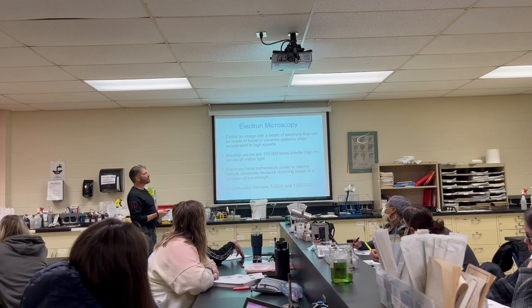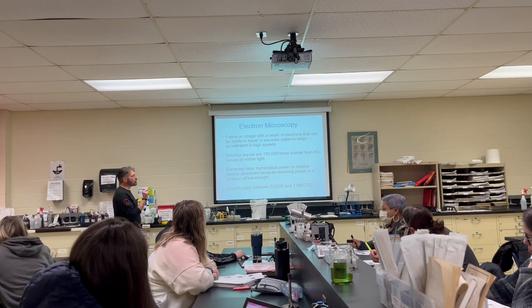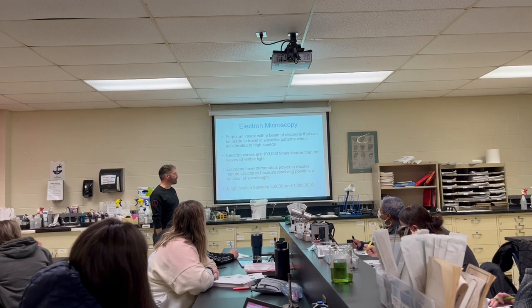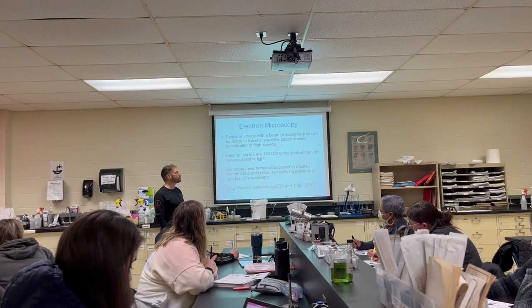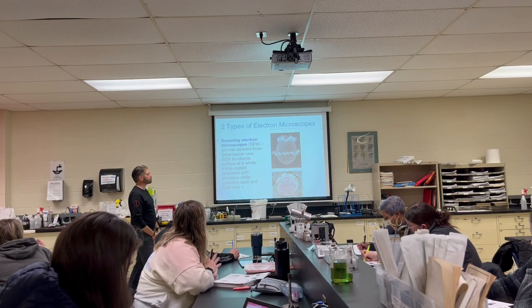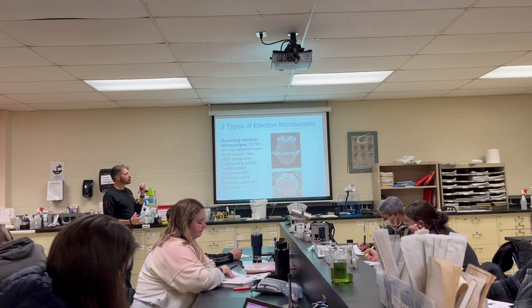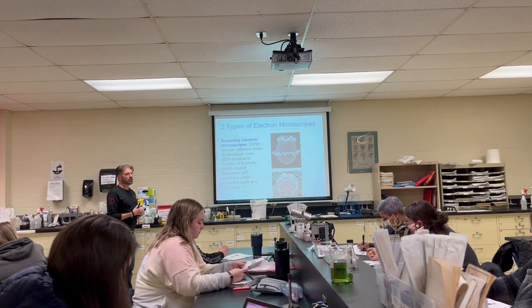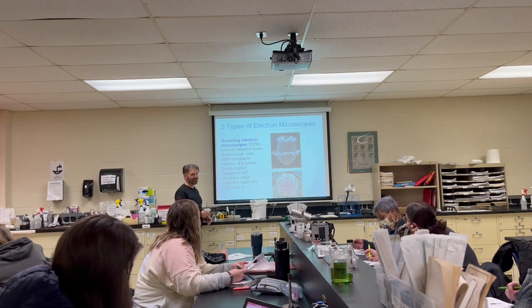And if they ever ask you, the most resolving power is the electron microscope, because we changed the wavelength. That's all it is. Magnification is between 5,000 and a million, so much, much better. And there's the scanning electron microscope, which gives you really good, super cool details. You guys probably don't think that's exciting, but I nerd out. I love this stuff.